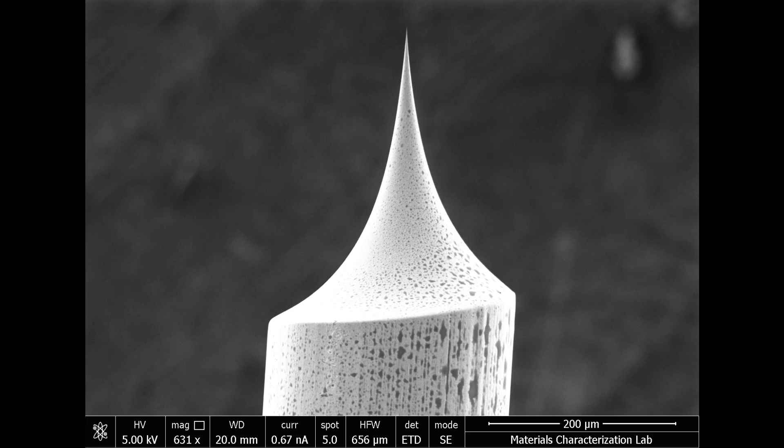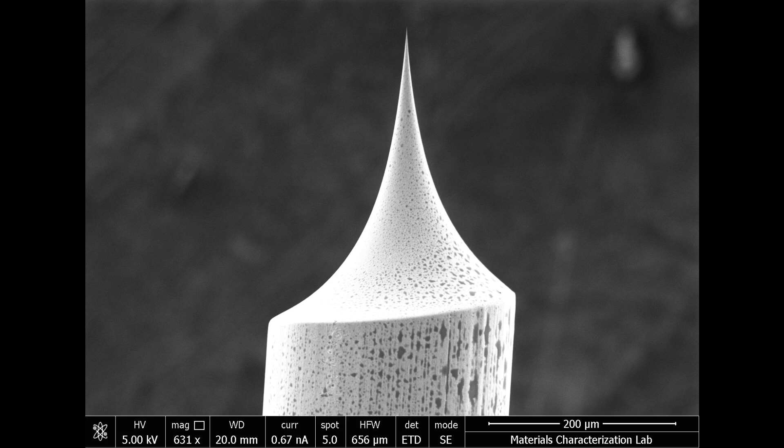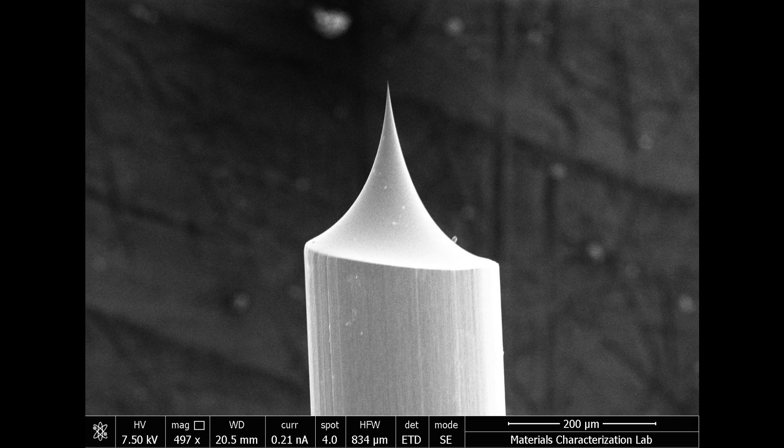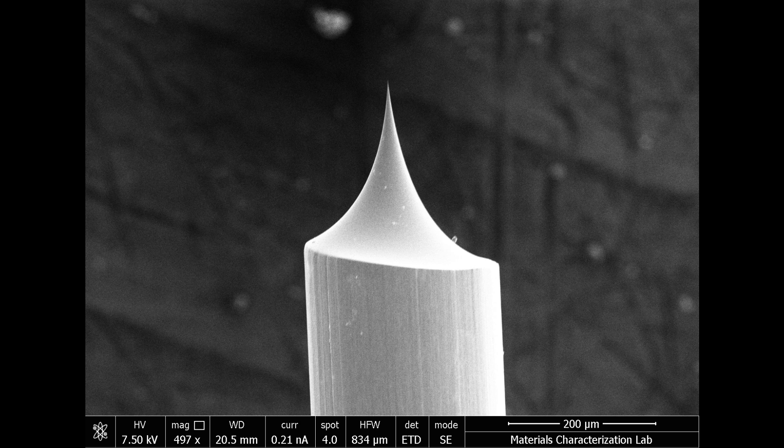I imaged some tips with a scanning electron microscope. The first picture is a tungsten tip etched in sodium hydroxide, then rinsed in deionized water. You can see there's a black precipitate from the etching still present on the tip. The second tip, that was rinsed in 12 molar HCl after etching, you can see the oxide layer appears to be gone.